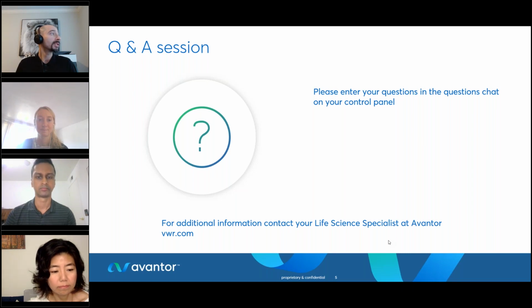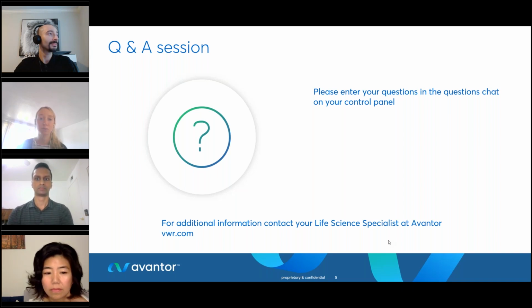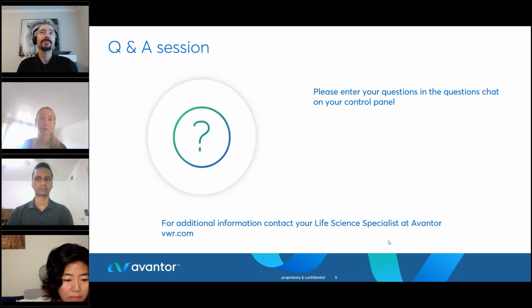Do we need a reference sequence for each plasmid? Sarah, would you like to take that one? Yeah, sure. So the workflow uses de novo assembly, so you don't need to provide a reference for any of the assemblies, for any of the samples. You can optionally add an insert reference if you have one, and that will just be used for a few extra quality control steps in the analysis and will be output in the report. And that will be across samples and across plasmids, so not per sample.